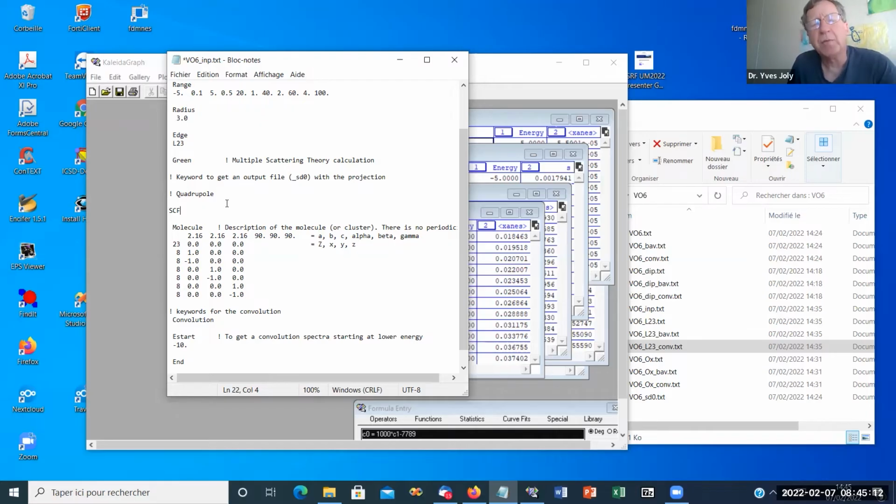Now, the most difficult point is when you have your atom in solution, and the counter ion is around it, but we don't know where. So you have to calculate a truly charged molecule in some way, because the counter ion is not in your calculation.